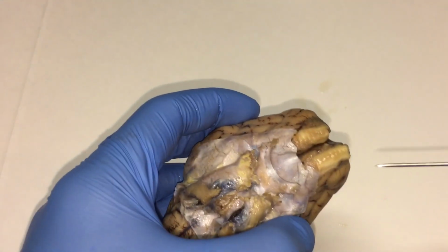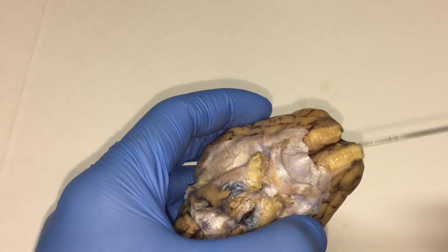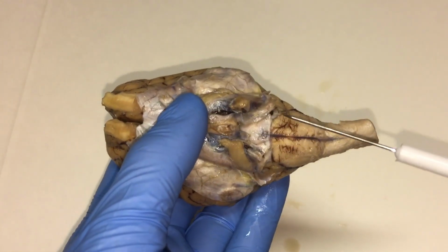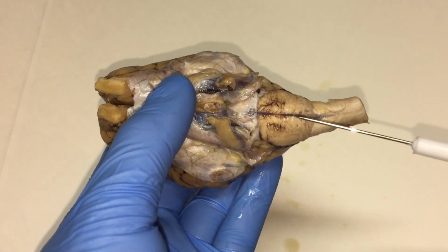Fourth structure I want to point out are these two right here. These are olfactory bulbs. They're involved in processing the sense of smell. And then the fifth structure I want to point out is over here, this being the medulla oblongata.